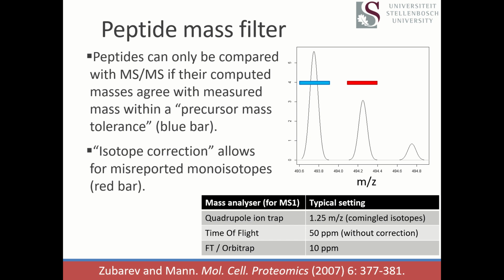In a tandem mass spectrum, you could trust that if it said the peak was located at 788, its true value was anywhere as low as, I said 788? It could be as low as 787.5 or up to 788.5. And we thought that was great. Things are so much better with high resolution. But it was much, much worse when we got to the precursor mass accuracy.